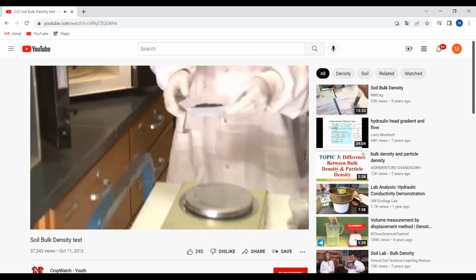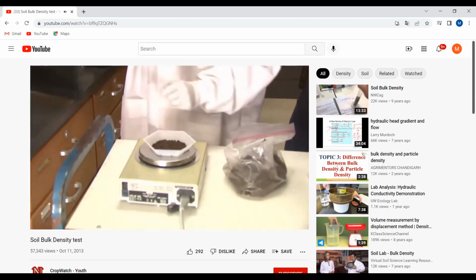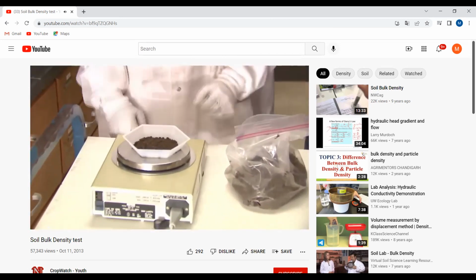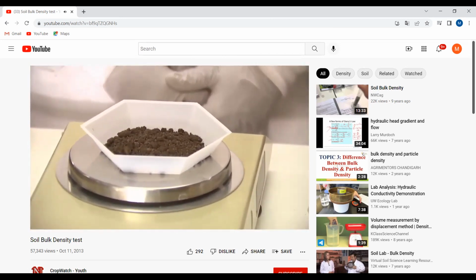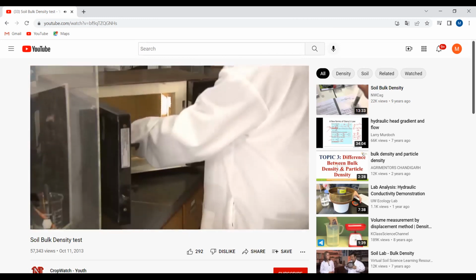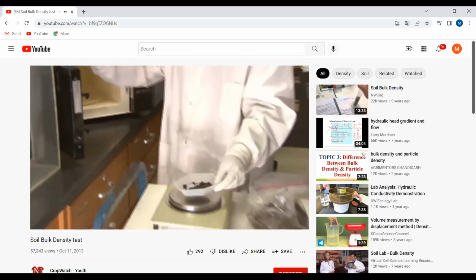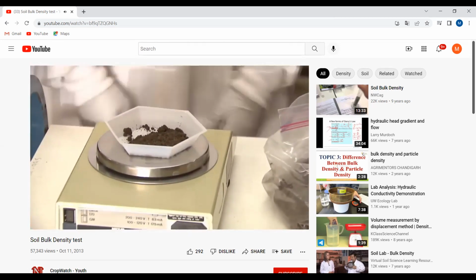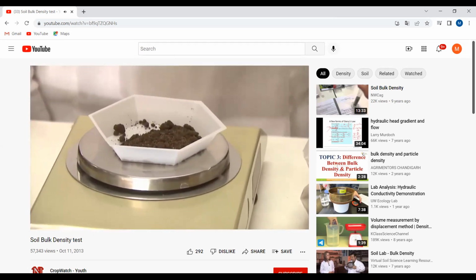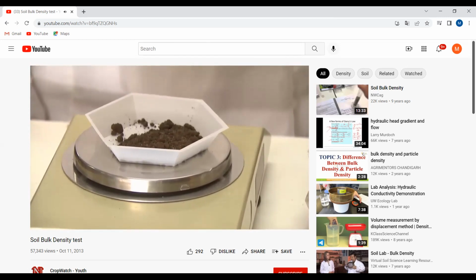Now we just got through our second 4-minute drying cycle at medium power. We're going to weigh it and compare it. In this case, we changed moisture just a little bit, so we're going to have to go through a 3rd cycle. Okay, we've just completed our 3rd drying cycle. We're going to compare it to the weight that we recorded from our 2nd cycle. In this case, it's weighing exactly the same at 153 grams.